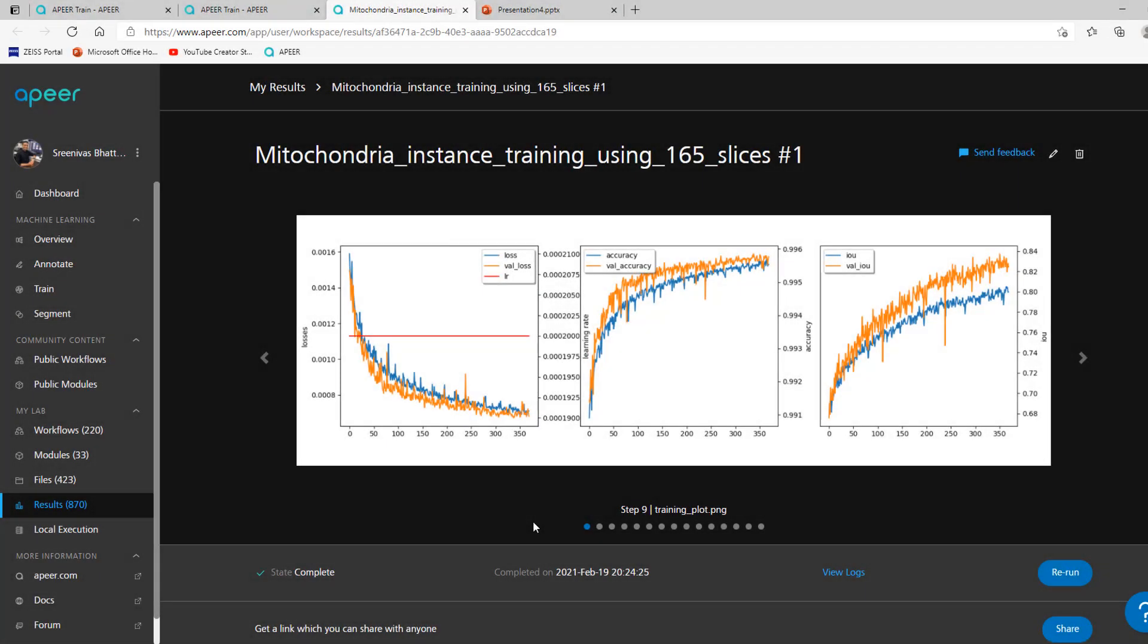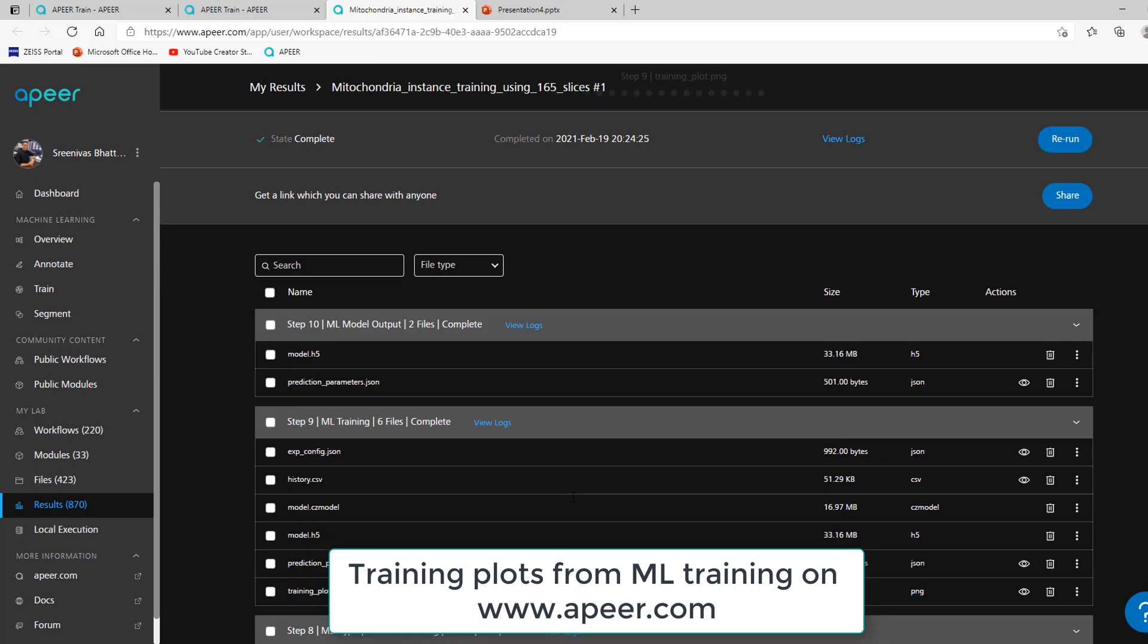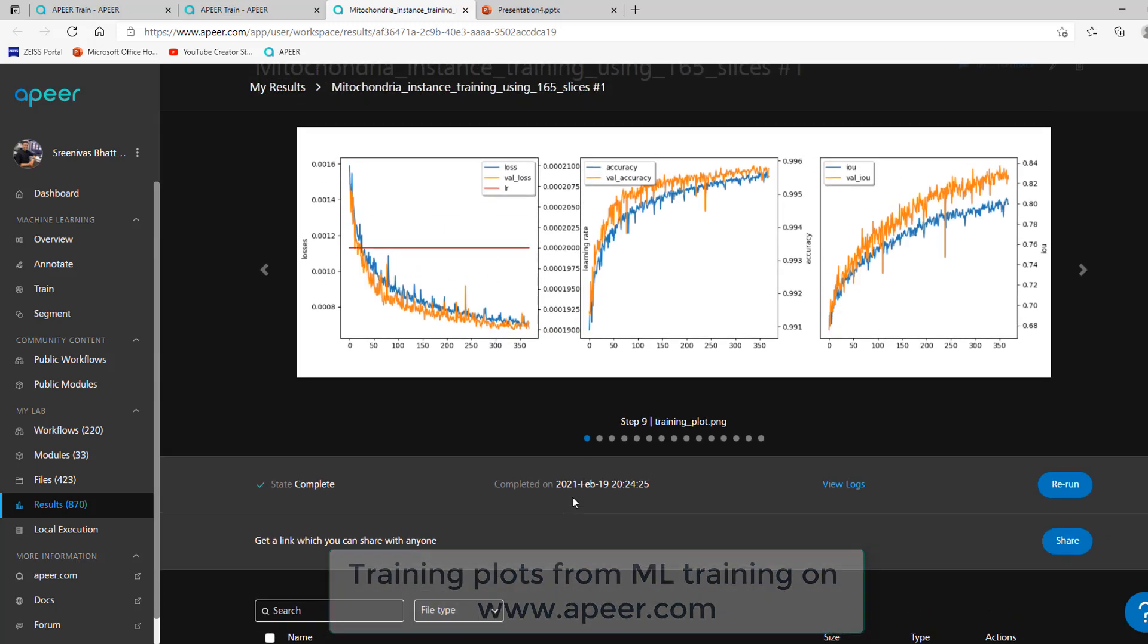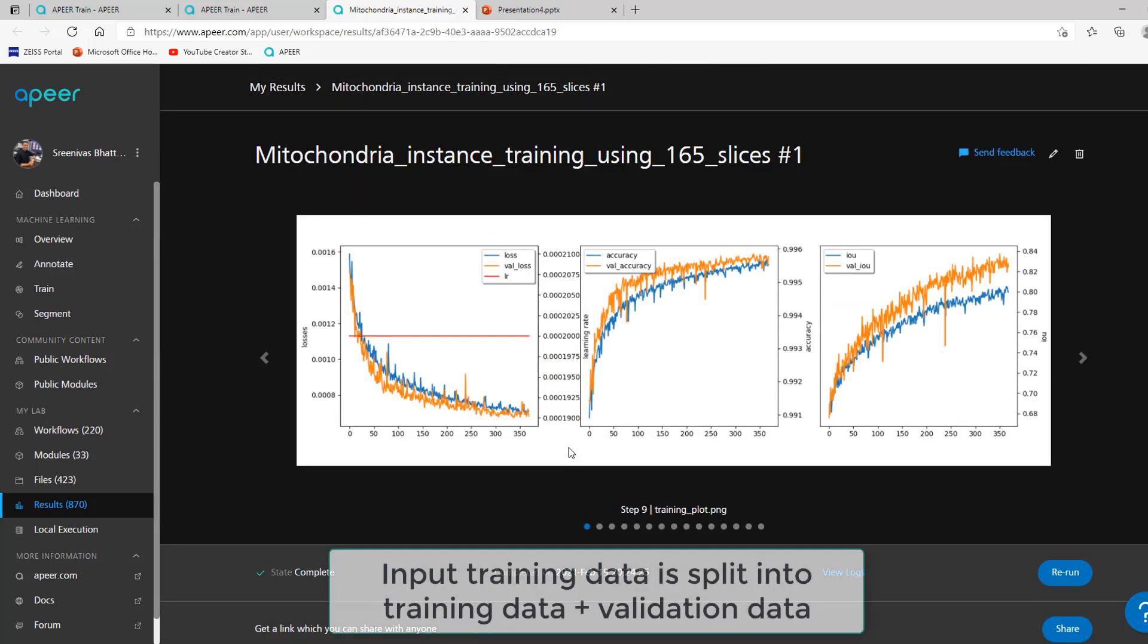This short video explains the training plots reported as part of your deep learning training on Appear. Your input data for training is split into two datasets.